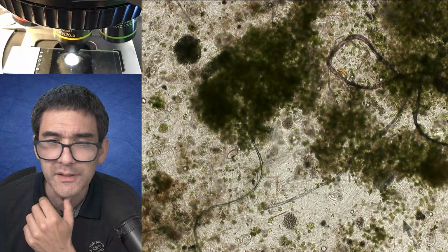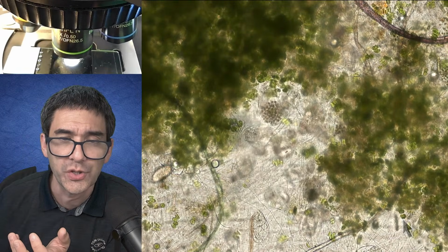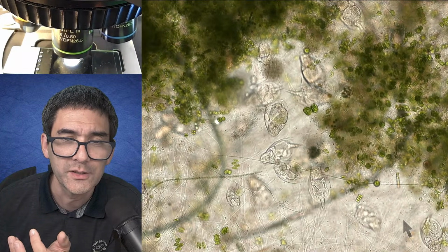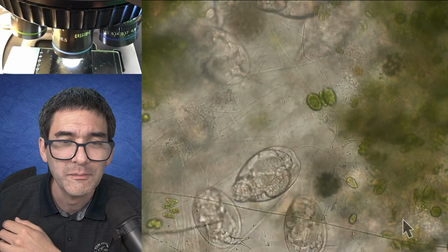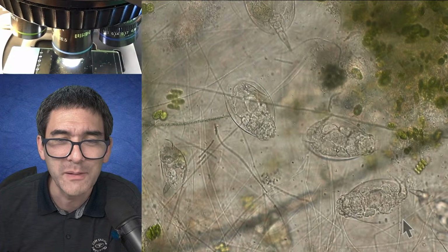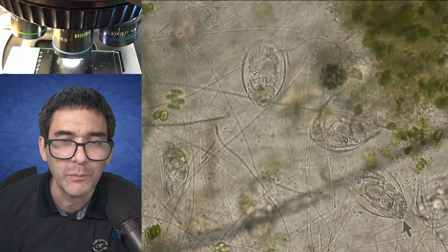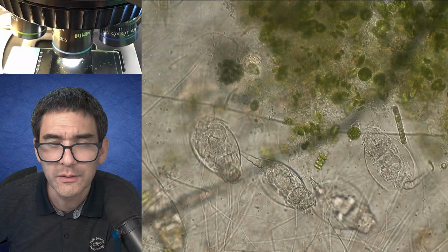Yeah, so it really depends on what organisms are present in the first place, and then you're simply enriching those. So with a different water sample, you might have gotten different ones. Actually, this is quite cute. Lots of rotifers here. A whole colony or family of them. Look at this. The microscope slide is also sufficiently thin so that they're all pretty much in focus. Let's remove the arrow again, it disturbs me.